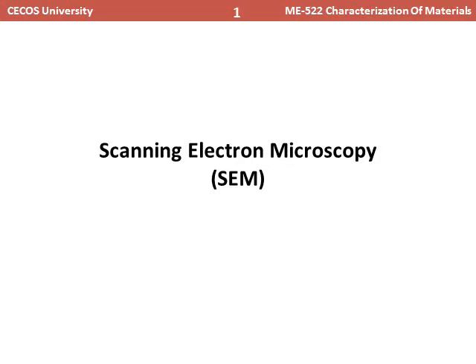This piece of equipment is abbreviated as SEM, and it's actually more famous, or known, by its abbreviation, SEM, than its full name. So whenever you have to recall this equipment, you can easily say SEM, so you don't have to recall the full name, scanning electron microscopy. So this was an interesting part of this equipment.